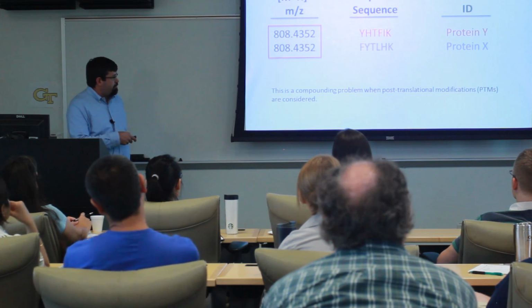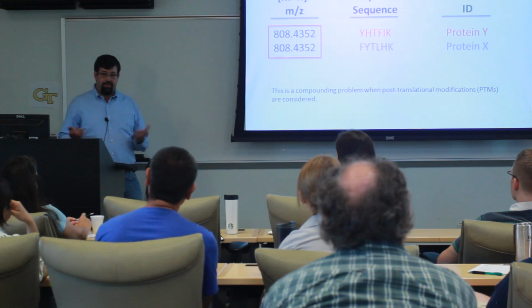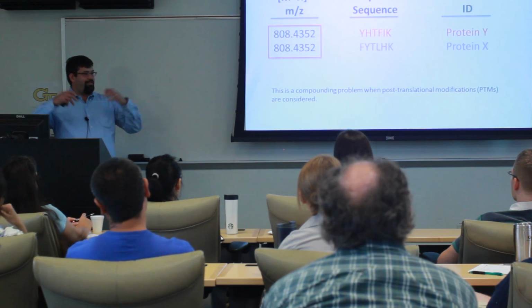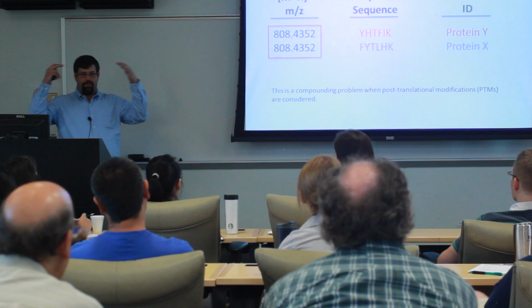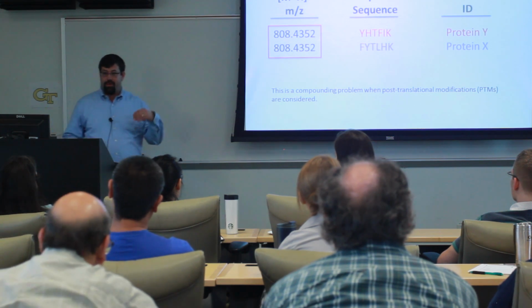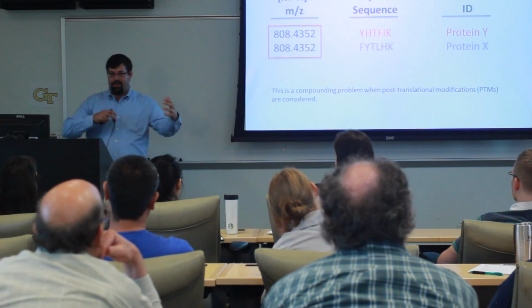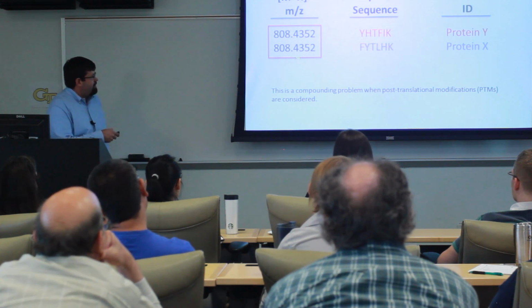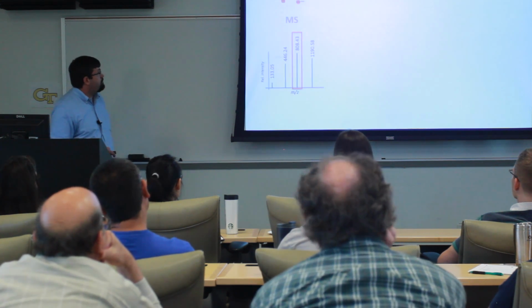This is a problem that is compounded if you're interested in post-translational modifications, because of course now there's a whole host of additional masses that you have to add to your theoretical digest that correspond to modified residues on each one of the peptides, increasing the chances that this problem can arise.